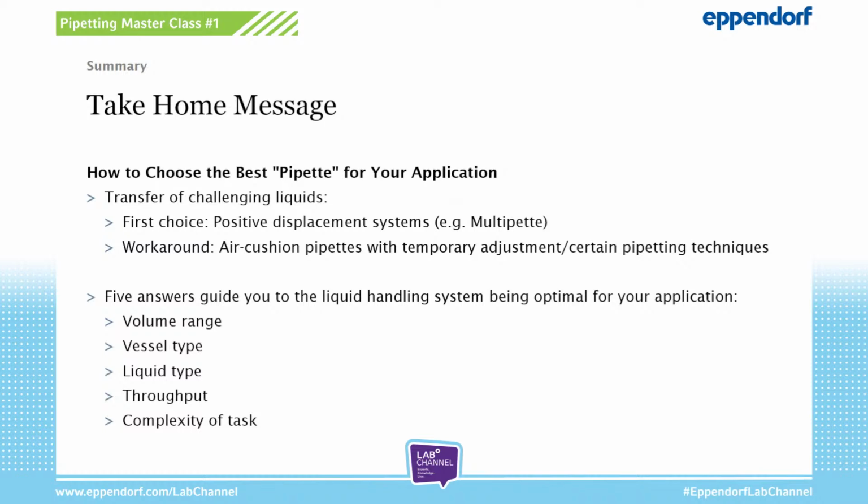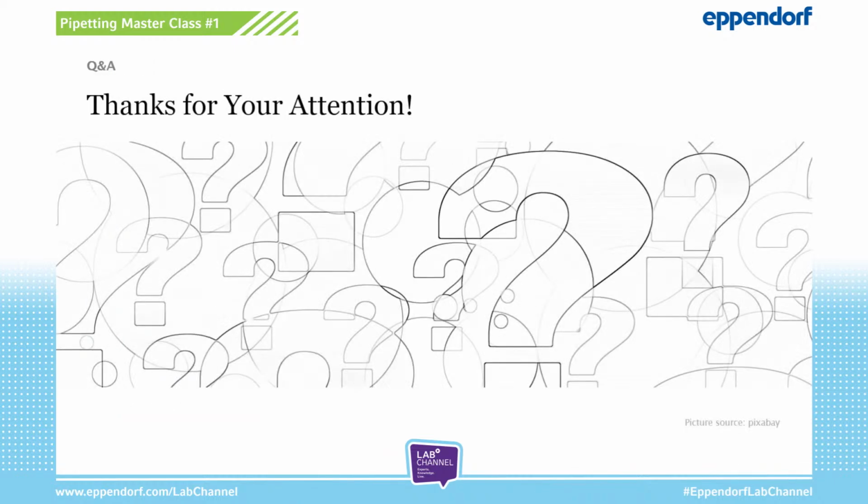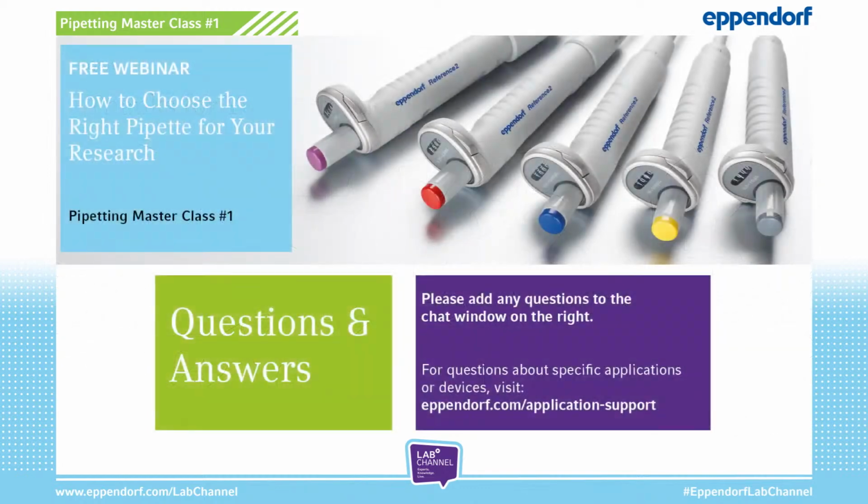And using the selection chart presented here, you can easily and quickly identify the suitable liquid handling tool and also tip. And with this, I'm at the end of our presentation. So thanks for your attention so far. And I would like to hand over to Simon again for our Q&A session.